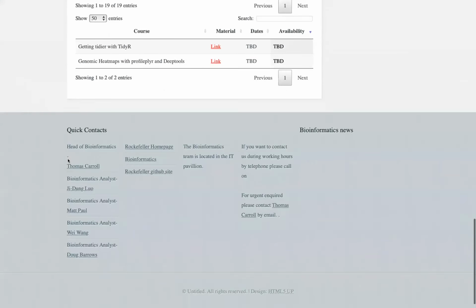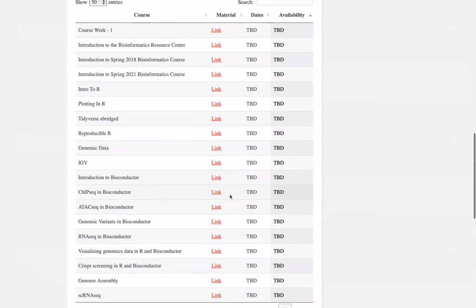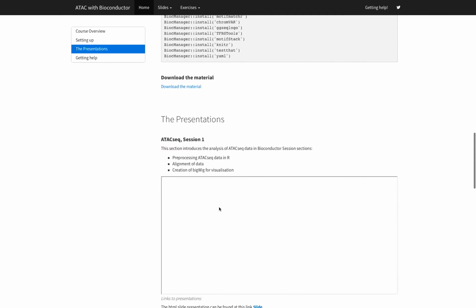So we have got through a lot of stuff now. We've done most of the basics, and we had a go at RNA-seq. The next technology we're going to look at for high throughput sequencing and how we can analyze it is ATAC-seq. So anyone here going to be doing ATAC-seq? You guys are going to be doing everything just as well.